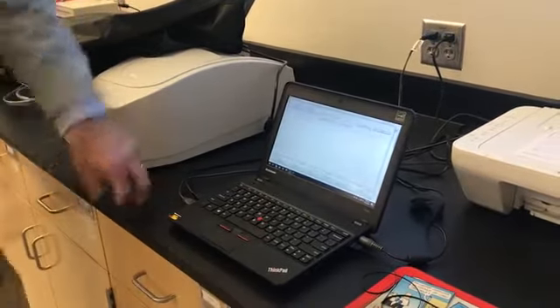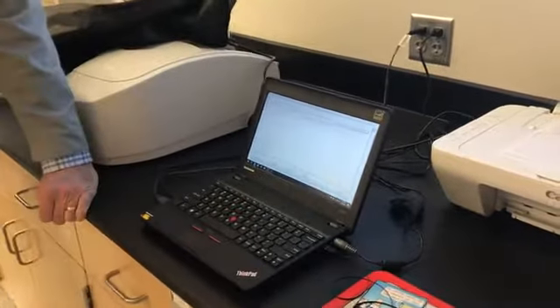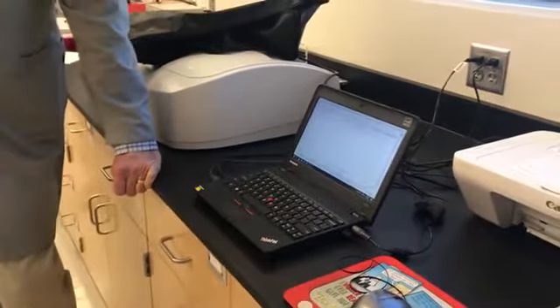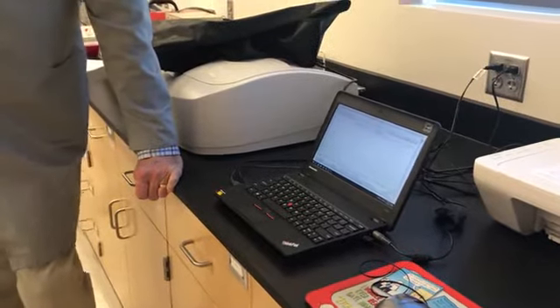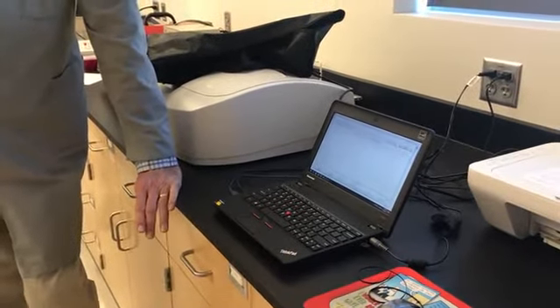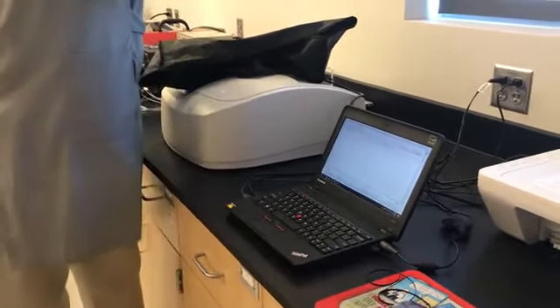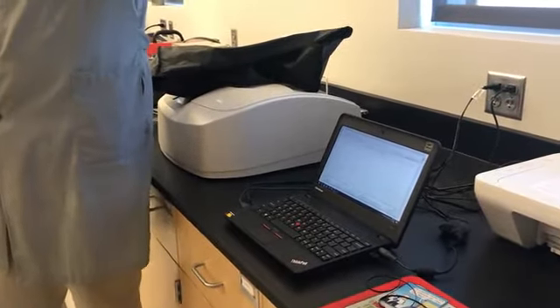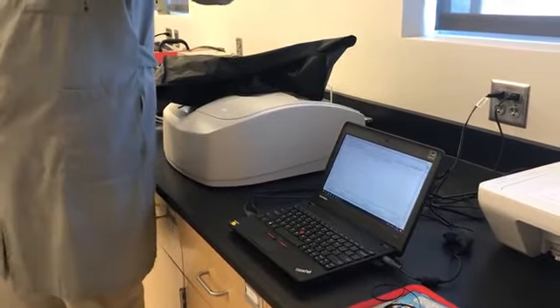We're going to scan from 4,000 wave numbers down to 600 wave numbers. And so we'll see the background scan, just the blank scan with nothing in the infrared beam. One of the reasons we do this is we can actually see absorptions due to the water vapor and the carbon dioxide in the air.